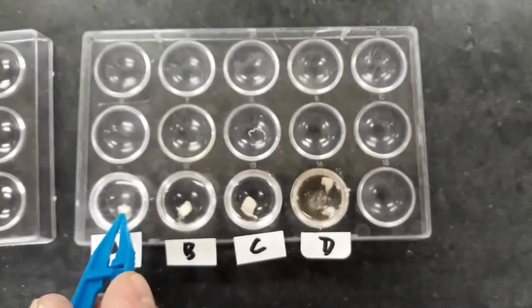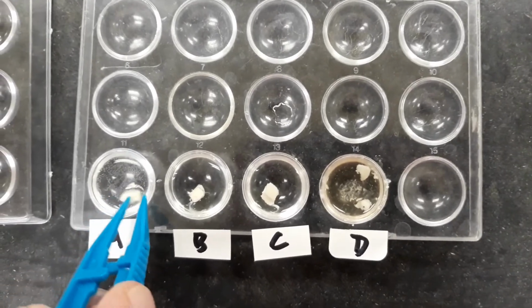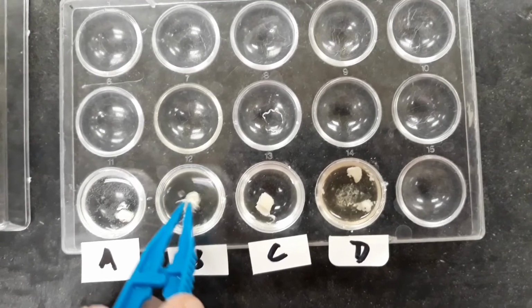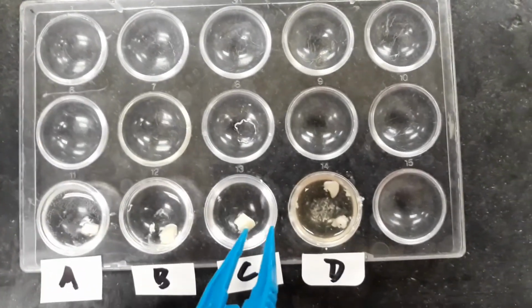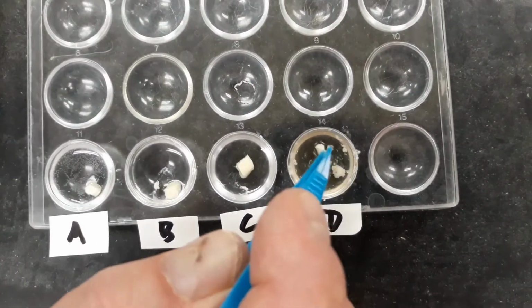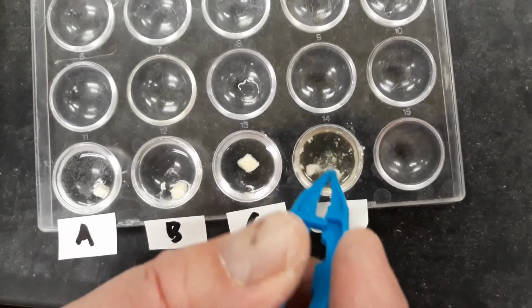And then for fat, this was some refrigerated butter. You can see A, largely unchanged, as is B, as is C, but D, it was easy to break apart, starting to decompose.